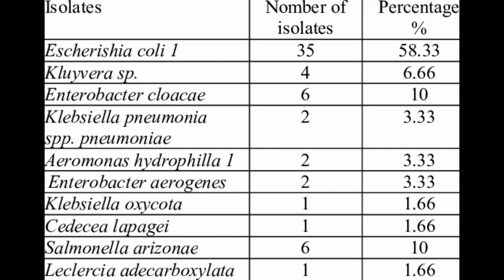Now let's talk about the urease test. It splits urea into NH3 and CO2. It requires a heavy inoculum of 5 loopfuls of the organism colony. The medium is urea broth with phenol red indicator. The positive is a dark pink or fuchsia medium, because the enzyme urease splits urea into NH3 and CO2, producing an alkaline pH in the medium, while the negative is no change in color, still orange, retaining the buff color of the medium.